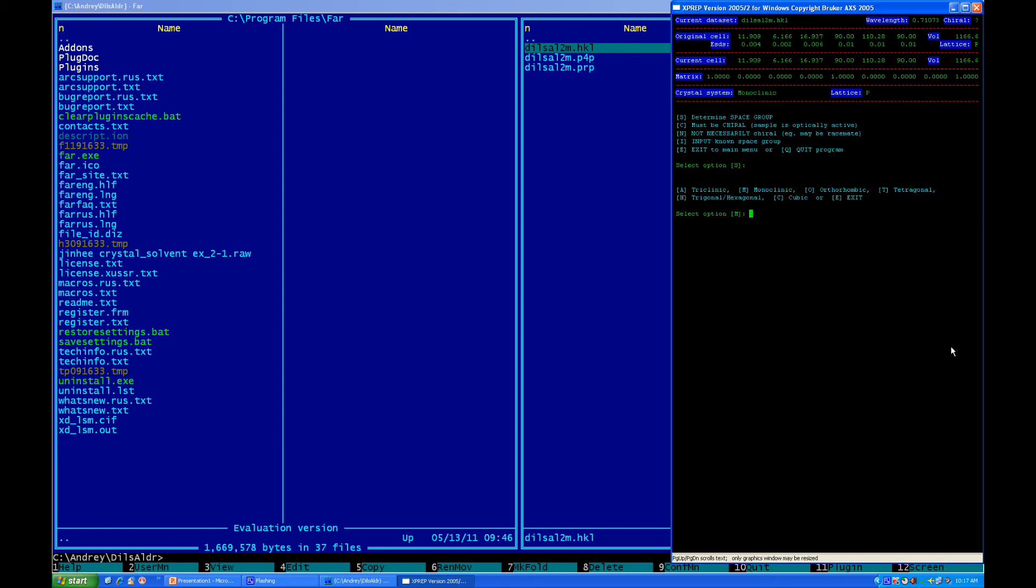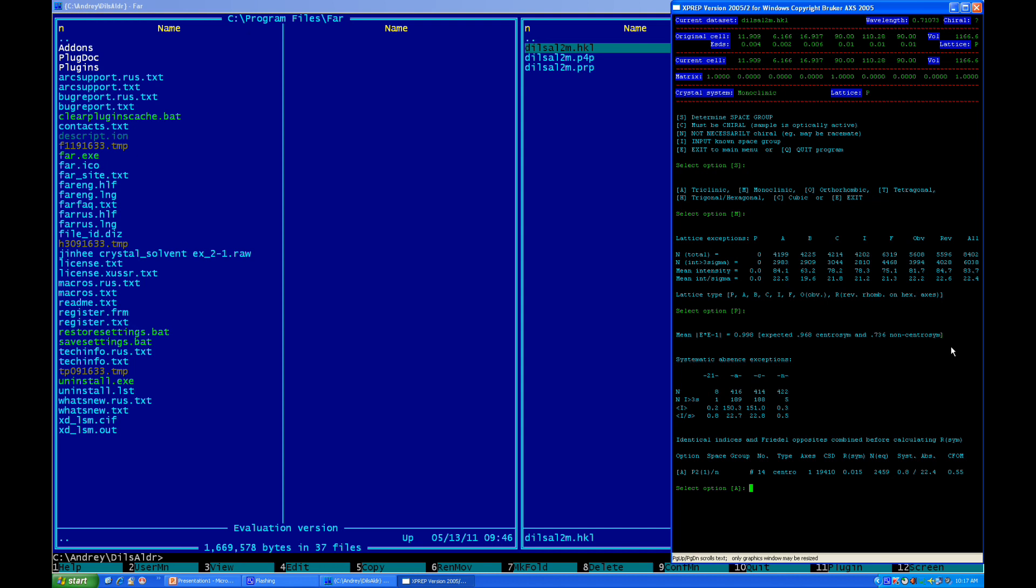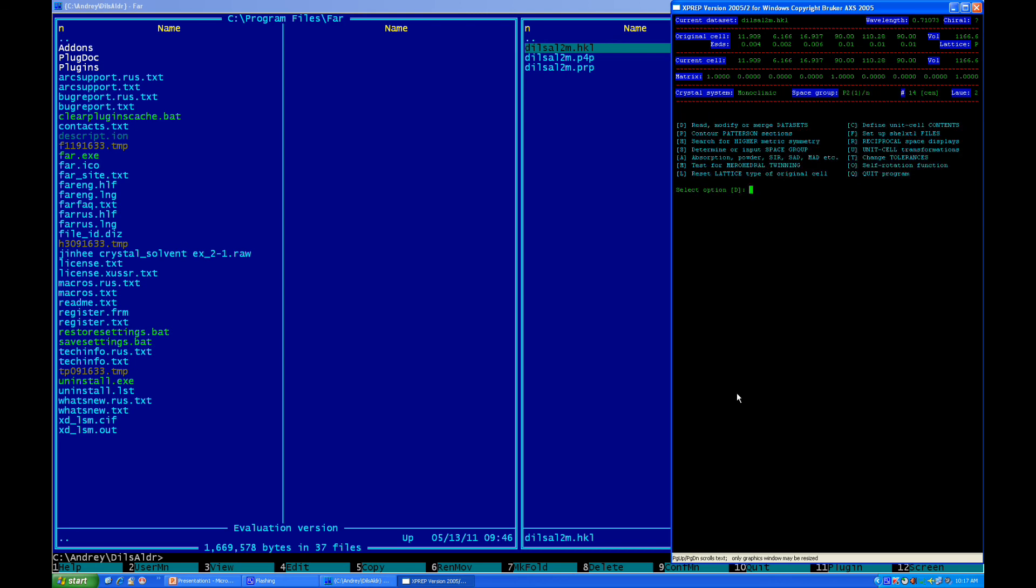After that, we determine the space group. You can see from the table of systematic absences, located right here, that we have a 2₁ and n. And, plus, here's e squared minus 1 statistics. The value of it is very close to 1, so it's very close to the value for centrosymmetric crystal. Combining these two facts, we have only one choice of the space group, which is P2₁/n. That's what programs suggest us to use. We have P2₁/n.